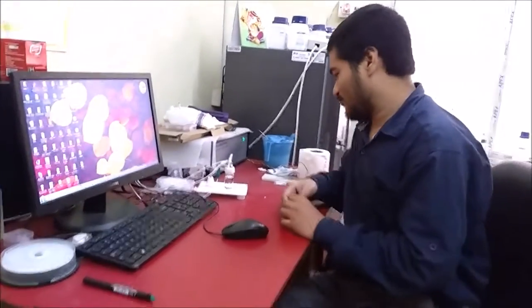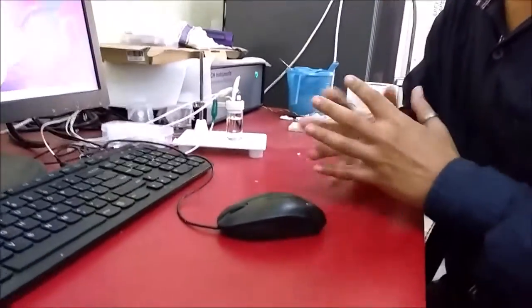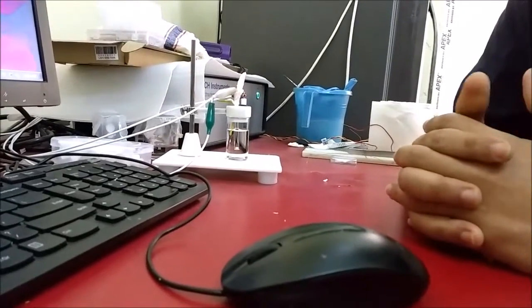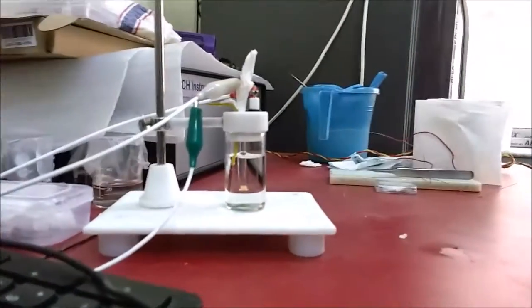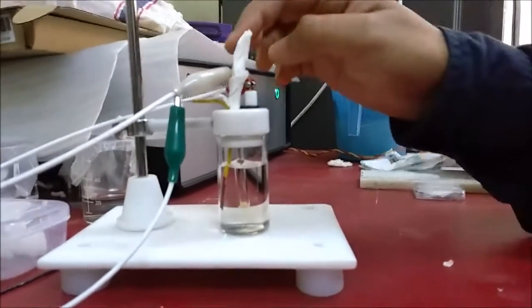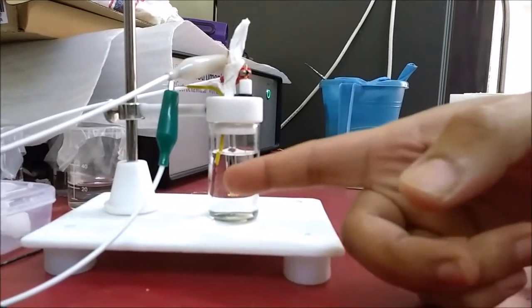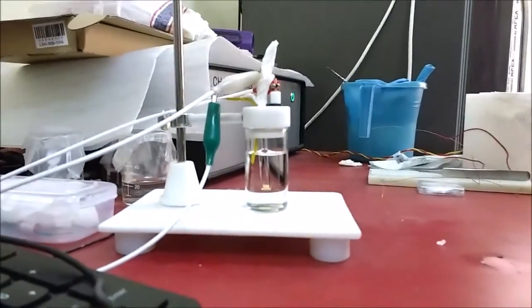I have put lithium acetate solution — an aqueous solution of lithium acetate — which will be used as the lithium precursor. Here you can find the platinum electrode, which will be used as the counter electrode, the Ag/AgCl reference electrode, and this is the working electrode connected with the green lid.